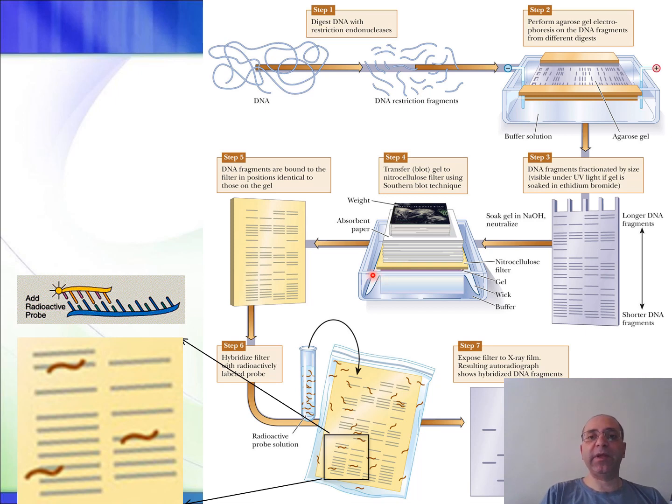Okay, so it's placed underneath a membrane, and these DNA fragments are transferred from the gel to the membrane. So you have the membrane right here on top. The DNA fragments move upward onto the membrane, and the DNA fragments are now attached to the membrane.